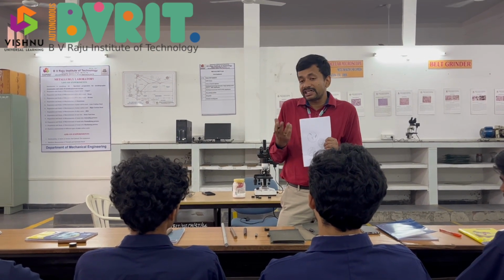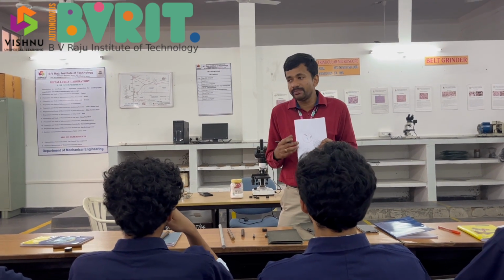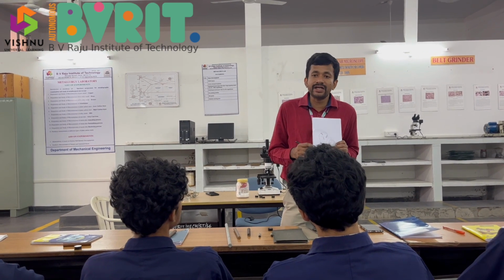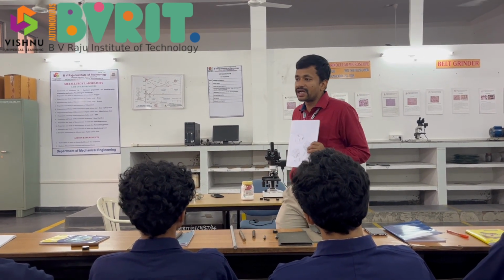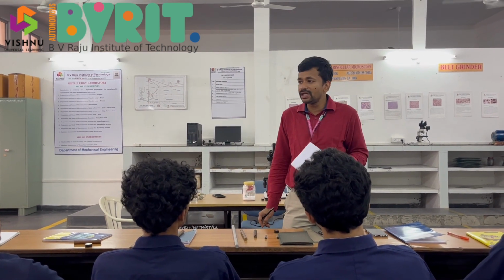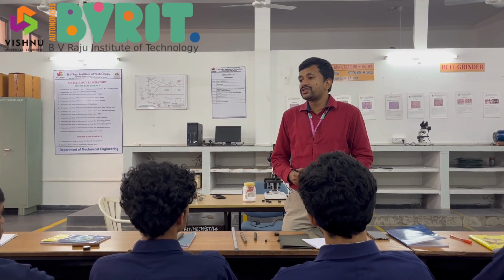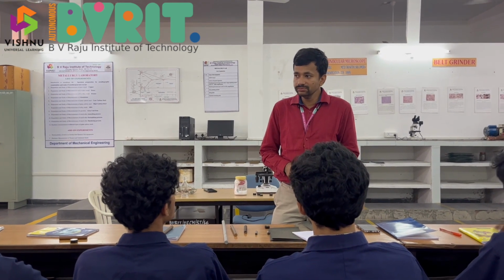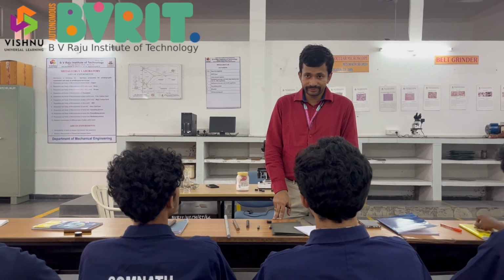All those things we'll discuss in the class in detail. But for this lab, I think this should be good enough for understanding why we use this etchant at all. Why can't we directly see under the microscope? None of the metals can you see directly. There is an etchant even for stone like marble and granite, and that's how you characterize and observe.